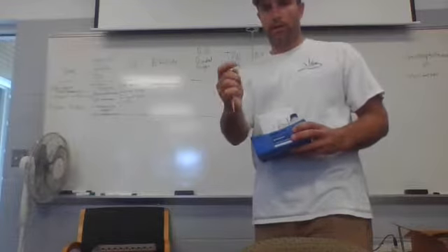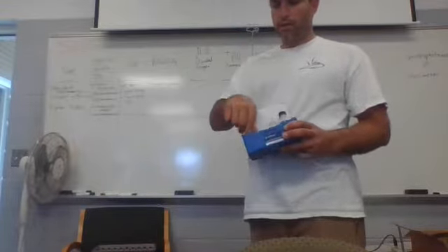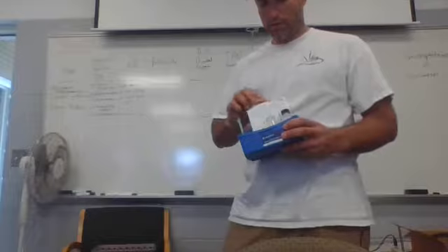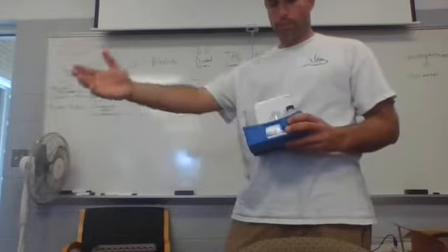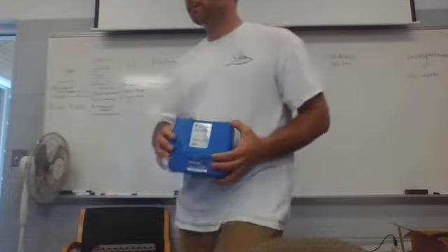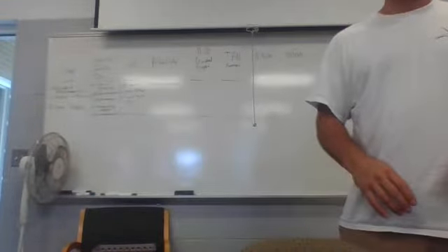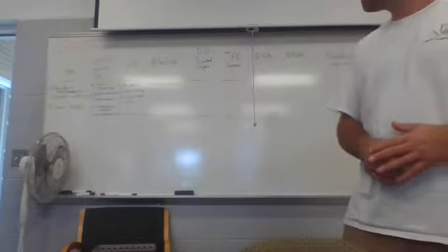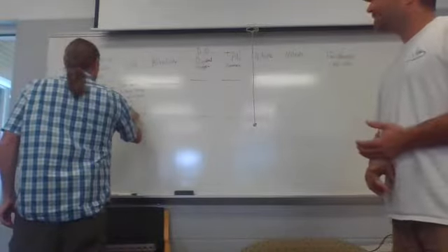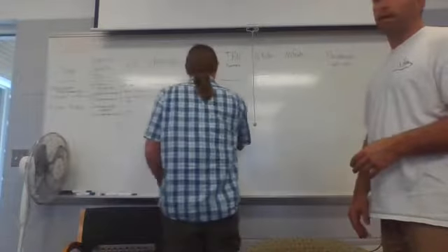This one is, again, using the little scale on the syringe, and you add your indicator. It'll change blue, and then there's your color change card that should be in here. It goes from basically blue to purple to pink, and at that interface between pink and purple, you are there. Any others for alkalinity? Right, spectrophotometers for all of them. There's not really any meters that measure alkalinity directly. So titrations are the primary way of measuring alkalinity.